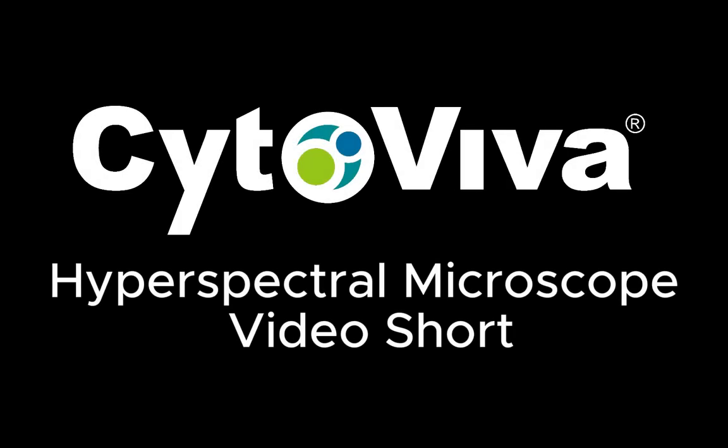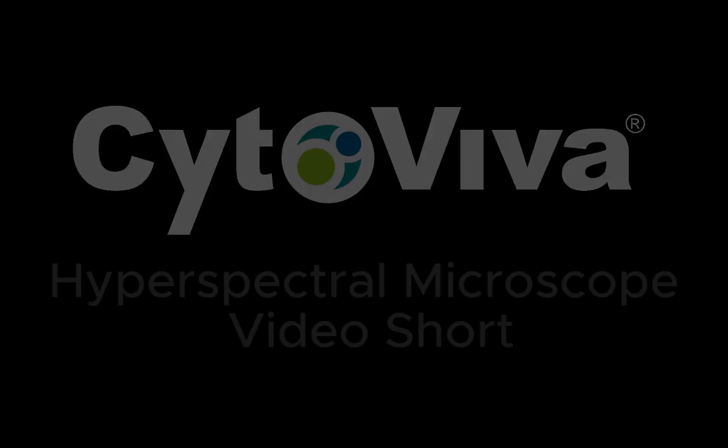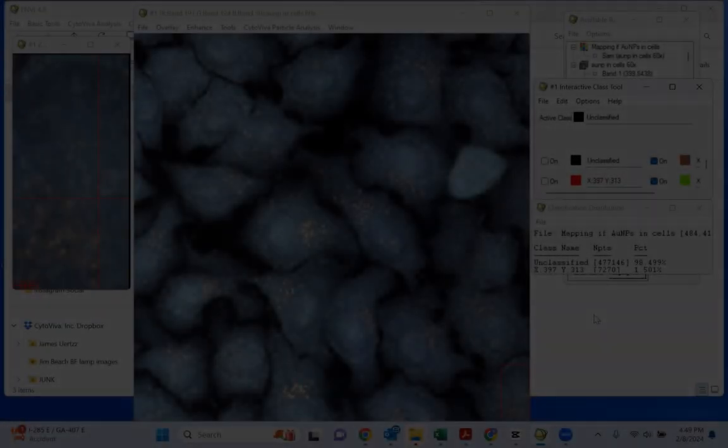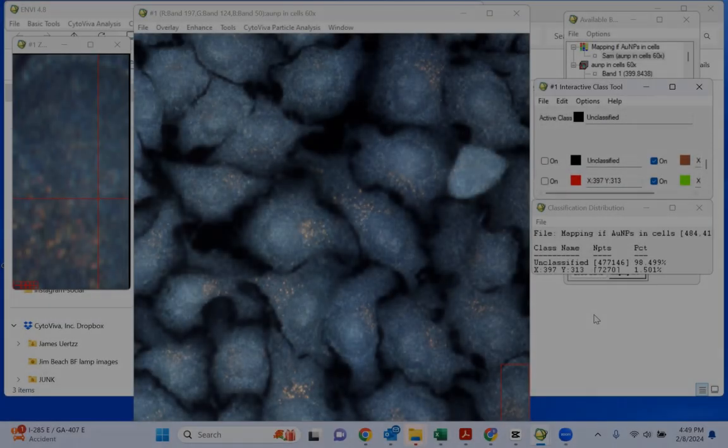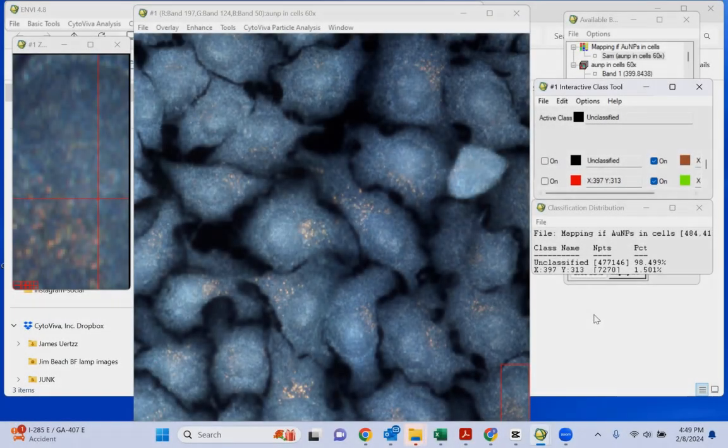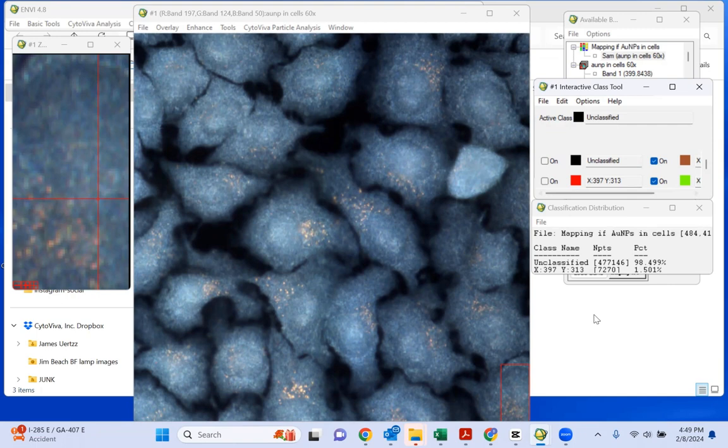Hello, and welcome to another hyperspectral microscope video short from Cytaviva. Hey everyone, this is Jamie with Cytaviva here, and today we're looking at some gold particles inside some cells.